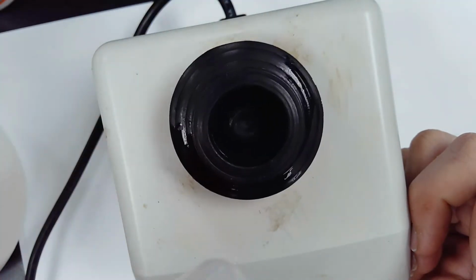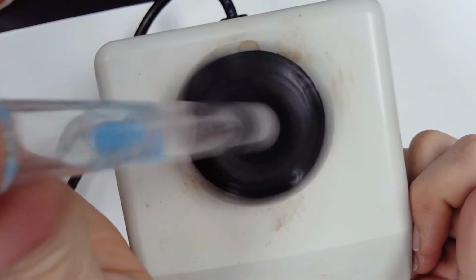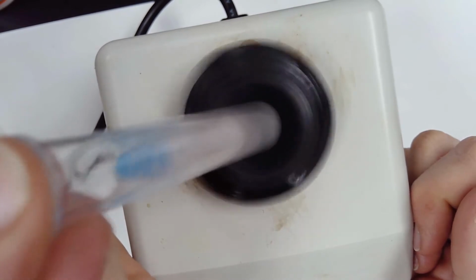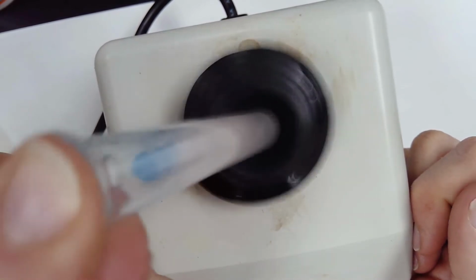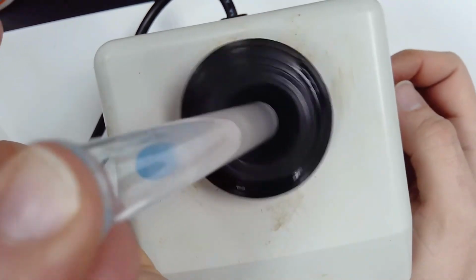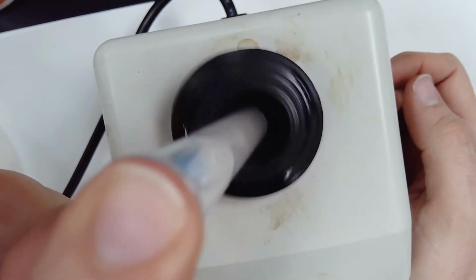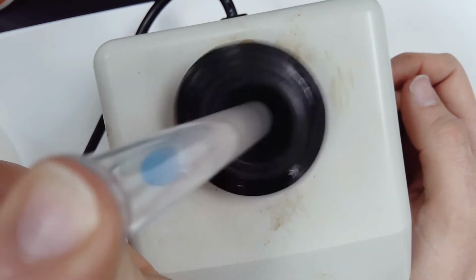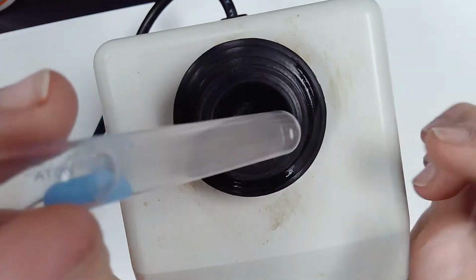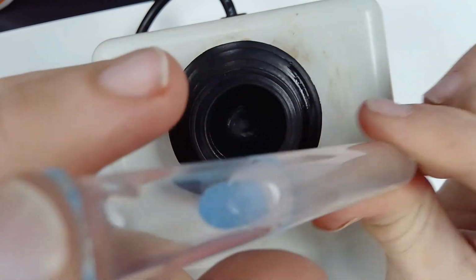Now, it hasn't dissolved all that sodium hydroxide. It's going to take it a moment. But that's a lot better than me having to do this by hand, right? I can just sit here and I can vortex it up. Now, as I do this, this solution is getting hotter. It's releasing heat. It's been a little bit of time, but we had a name for that in chemistry. So what would we call a reaction that generates heat? Right, so this is an exothermic. Exo means giving off heat. And you can see I've dissolved all the sodium hydroxide.